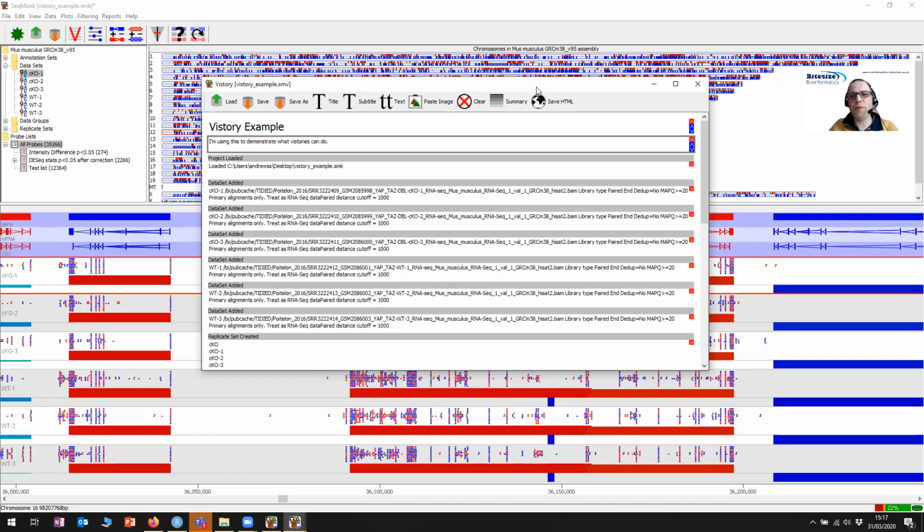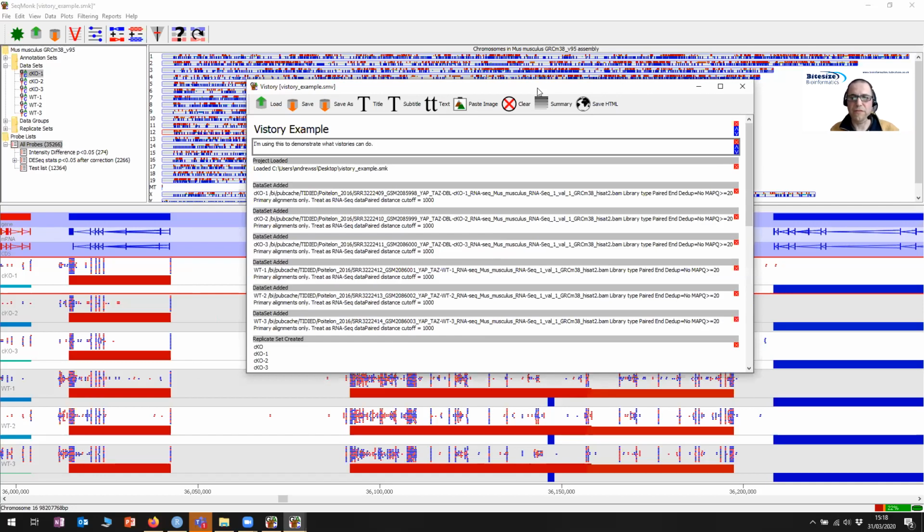Before we go any further, it's probably worth talking about saving and loading Vistories as well.